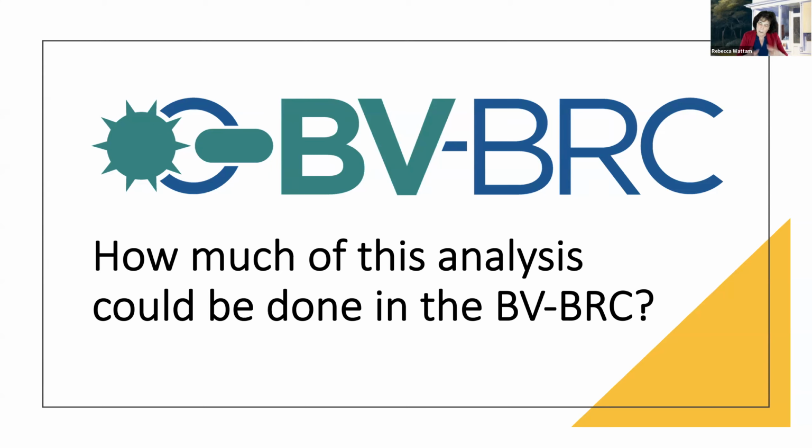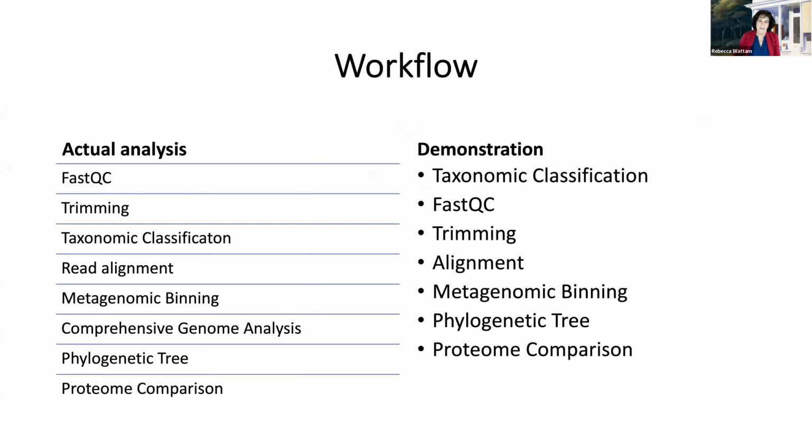But I wanted to see how much we could do in our analysis. So for this presentation, I had so much fun with this data set, and I chewed on it and I manipulated it. And now I have a much better understanding of the data massaging that would make this thing better. Unfortunately, if I was going to do that today, to go to all the steps that I did, it would take too long. So I'm going to do a streamlined presentation.